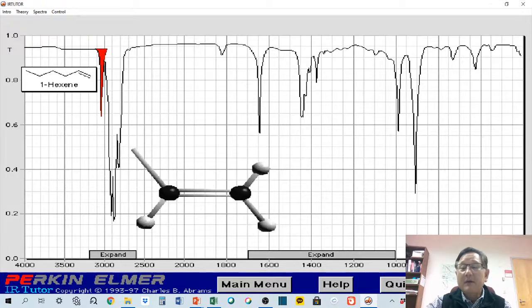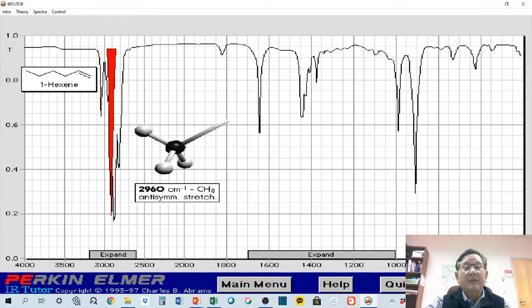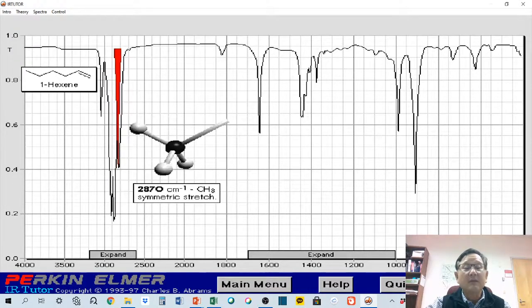If I go to the other portion, this is another kind of motion called symmetric stretching. This is an anti-symmetric stretching of the carbon with the three hydrogens. Molecules are at room temperature, so they have thermal energy to vibrate the bond, and this vibrational motion is captured by this bunch of peaks in the IR. The peaks around 3000 are particularly useful for us to look at the CH motions. So this is a symmetric stretch. All of this can be looked at, and it shows in the IR peak.